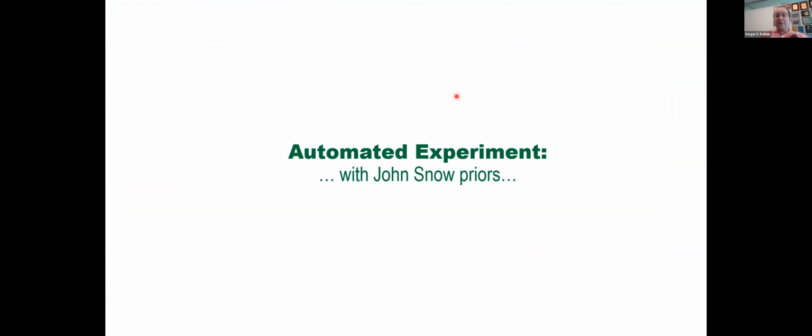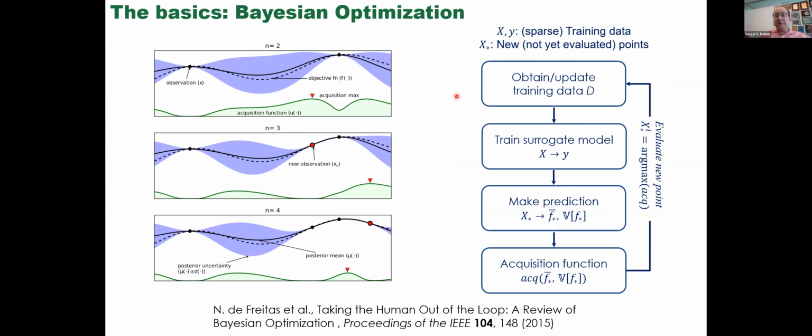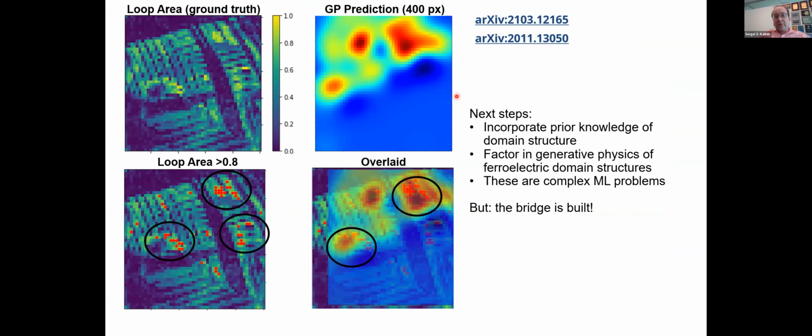What if we want to discover something new? So find some specific behaviors. Traditionally, this is done using methods such as Bayesian optimization based on surrogate Gaussian process models. So in our experience, starting from several years ago, for any real problem related to imaging, Gaussian processes in their pure form are almost useless. They simply allow us to improve the sampling by a factor of 3, which in a real scenario of the microscope is absolutely not enough.